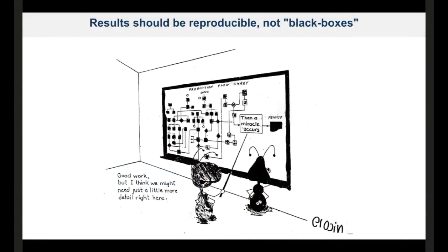Another big issue that I feel is not only in Cryo-EM, but in general in science, is reproducibility. In Cryo-EM, it would be really nice if we could just download the raw data and then follow the procedure of a given paper. Right now, I feel it is quite a miracle, as this slide says, to follow the whole pipeline with the same parameters and reproduce the same results. We can also think of reproducibility as the first step for validation as well, decreasing the threshold for allowing other people who cannot follow the same pipeline.